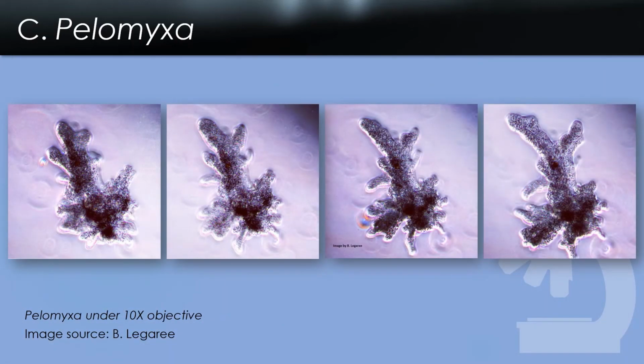This is not a video, this is actually some more photos that I took of amoeba under the 10 times objective. You can see here I took several photos. This was about maybe 10 or 15 seconds apart. You can see those pseudopodia changing shape as the amoeba is crawling along the slide. I thought these were some really cool pictures that I took.